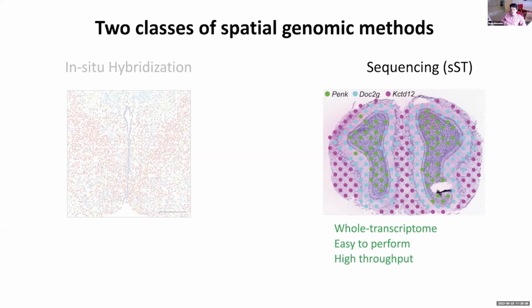Relatedly, another really big advantage of these techniques is their throughput. Because the imaging is done up front, and it can be done serially in very high throughput, once a slide is made, in the case of Slide-seq, the technology we developed with Faye, the slide can basically be put in a tube, and an individual operator can handle and process these libraries as they would an individual molecular biology reaction. So they can be massively multiplexed, to dozens of these slides in a single day's work.